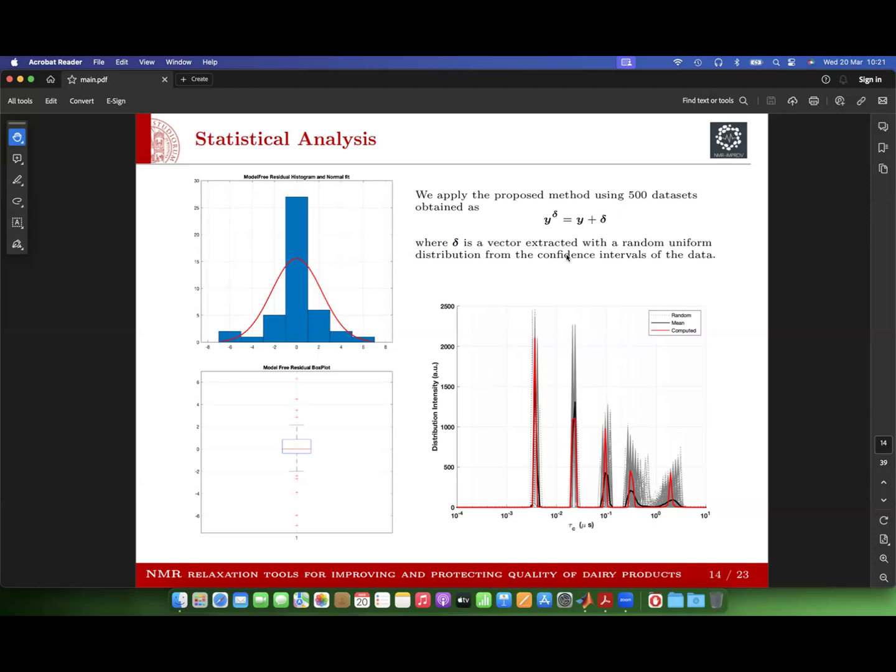However, the functions must be taken at different frequencies, not only at the proton frequency, but also at the electron frequency, which is like 658 times higher than the proton frequency. So it cannot be just decomposed into Lorentzian functions taken at the proton resonance frequency. And we are just worried that the distribution of correlation times is affected, but not taking into account all those quantum mechanical effects in the relaxation scenario.